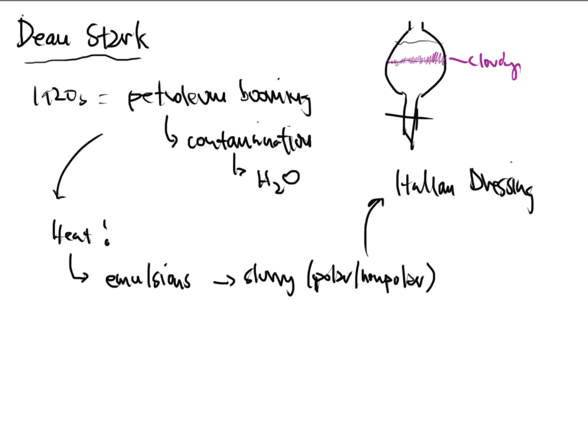And a white paper is basically a research paper. That's all that it is. So two guys in a laboratory. The guy's name was E.W. Dean and D.D. Stark. Paired up together, not Stark Industries, by the way, if you're an Iron Man or a Marvel comic fan. But E.W. Dean and D.D. Stark sat around a laboratory, and they basically came up with a way that they could separate this water from a sample. And this process never really had been done before, or at least hadn't been published before.